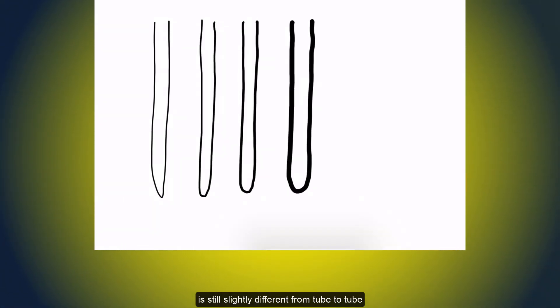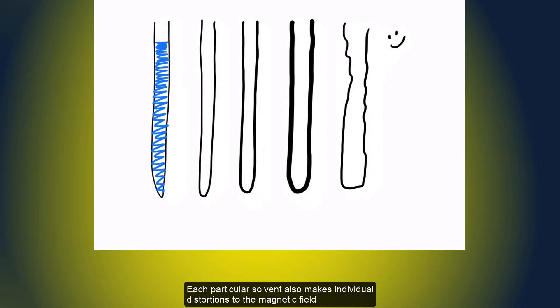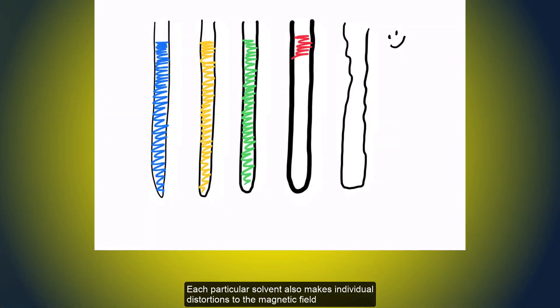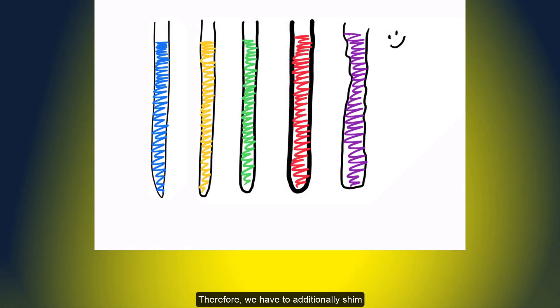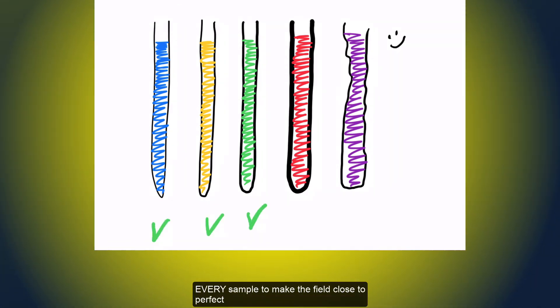However, the NMR tube glass is still slightly different from tube to tube. Each particular solvent also makes individual distortions to the magnetic field. Therefore, we have to additionally shim every sample to make the field close to perfect.